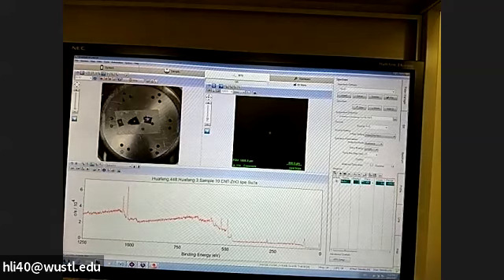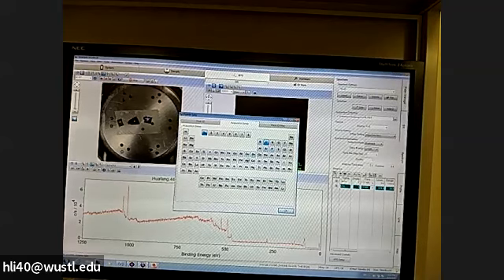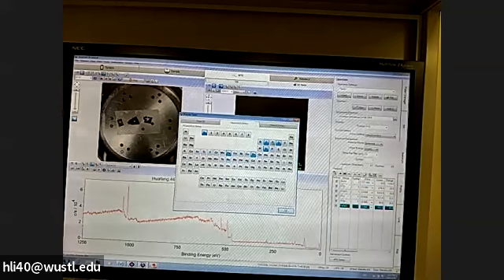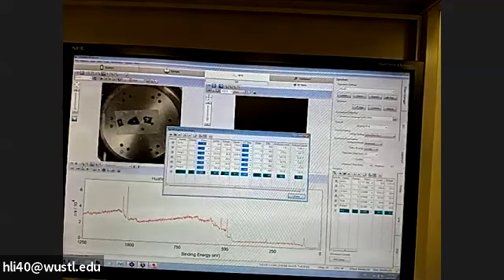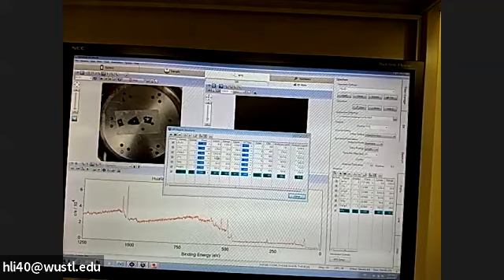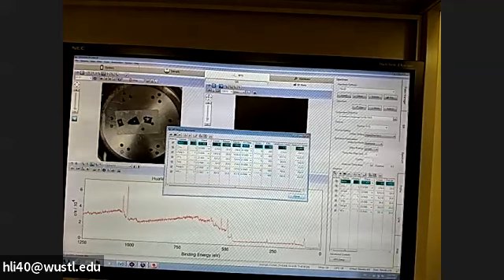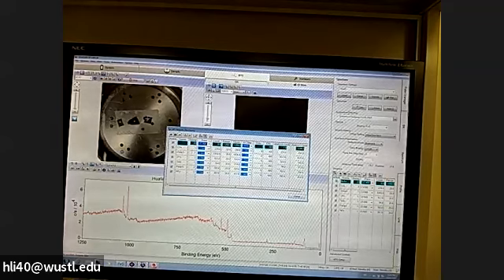For the elements in this case, I go to the element table. I'm interested mostly in carbon, and zinc, oxygen, silicon, iron, and nitrogen. So these are the elements I'm interested in. I select all the elements there so I can take a full view. The sweeps, normally for a better survey spectrum, I put 20 to itself.